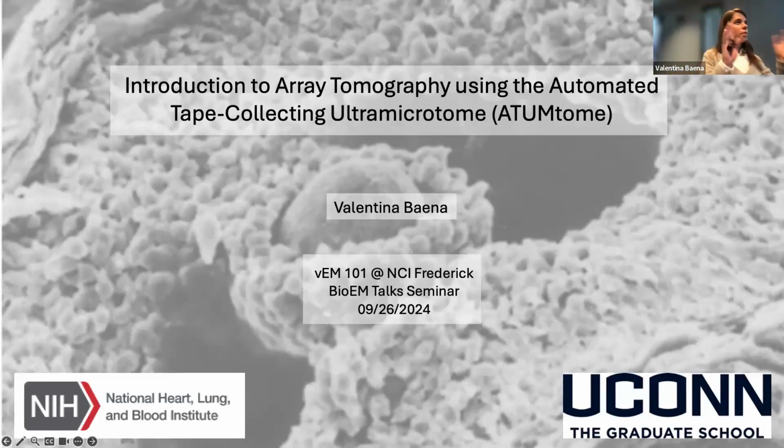And it's a little bit different flavor from what Dr. Westlake just presented. This is going to be mostly to show you an introduction on the method, which is using the automated tape collecting ultramicrotome or the ATUMtome as a way of doing array tomography.